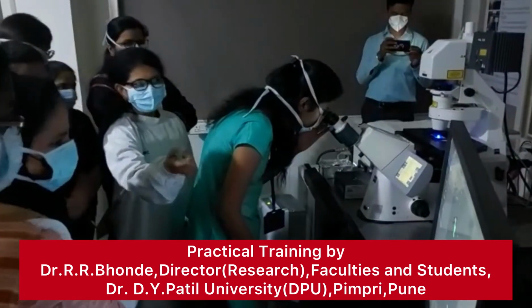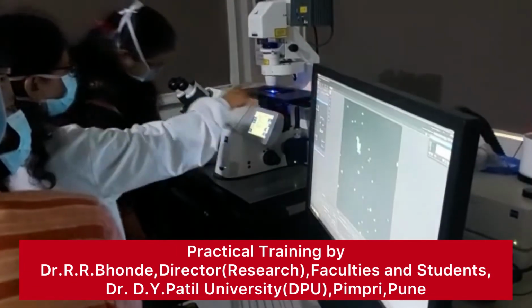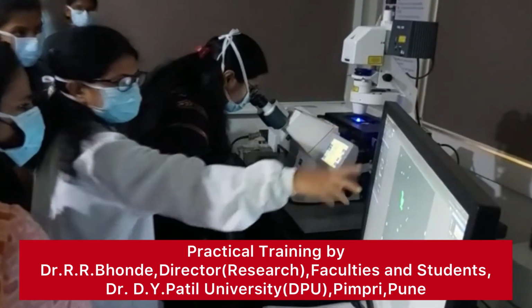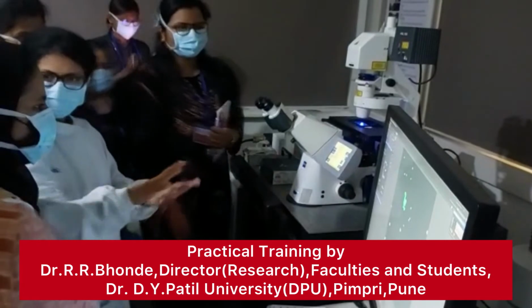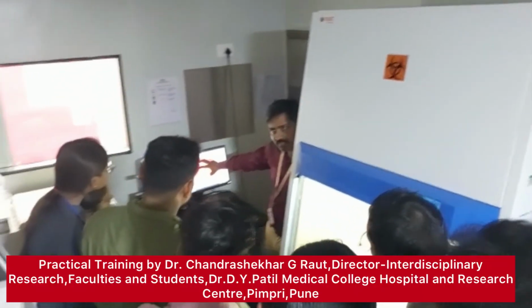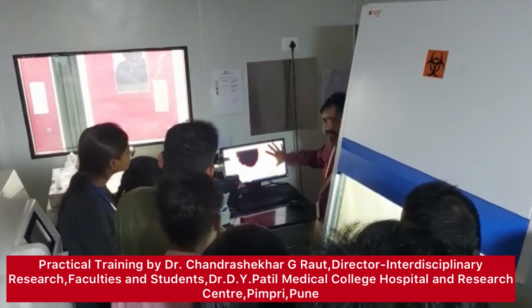It has the same image, but we have to switch from locate to acquisition. For locate, it is used in the microscope, and if we switch to acquisition, then we can see the image here. So this black one is a tissue. Is it visible to everyone? And from here you can see an outgrowth. So this is the outgrowth of the cells.